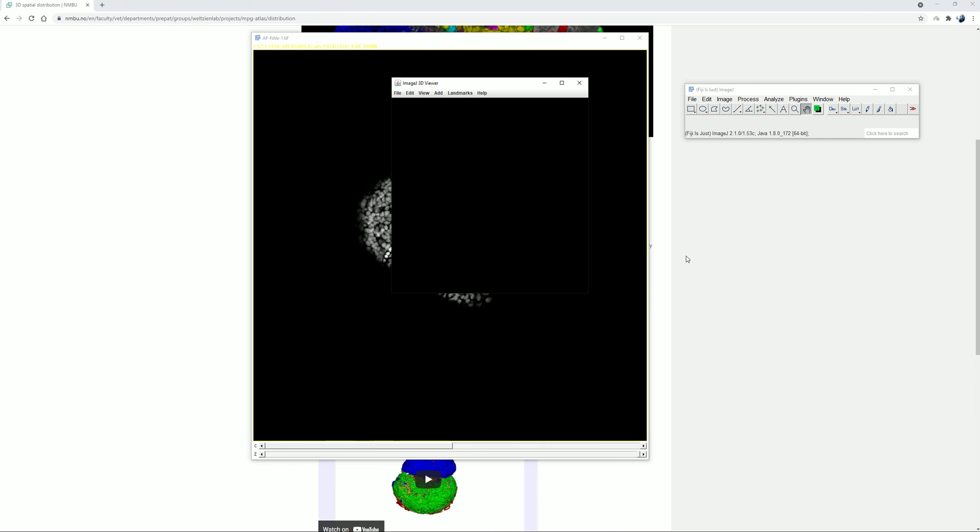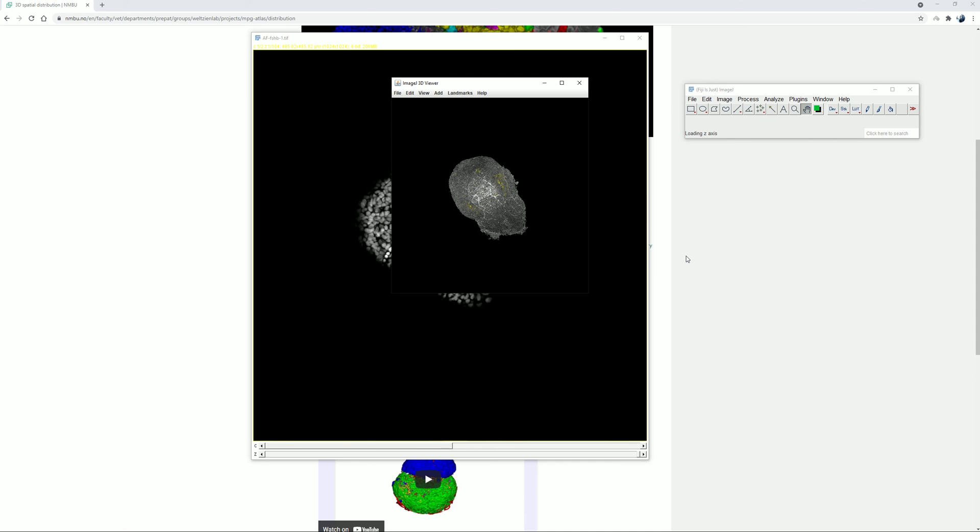It will take a couple of seconds before the 3D model pops up. Now, we can navigate this 3D model by left clicking and holding the mouse button a little bit far from the 3D model, while moving it to the orientation that we prefer.